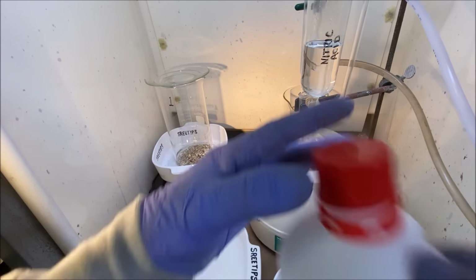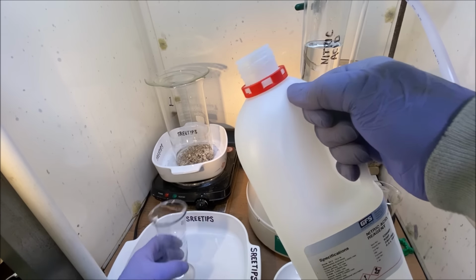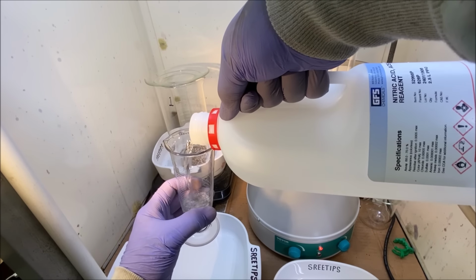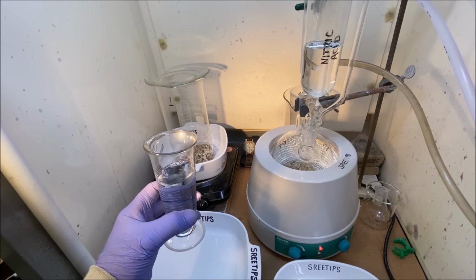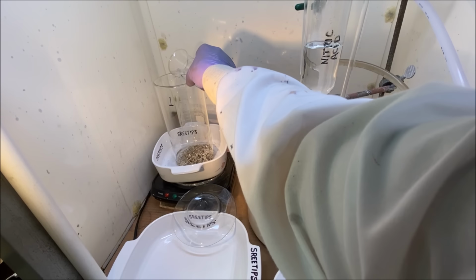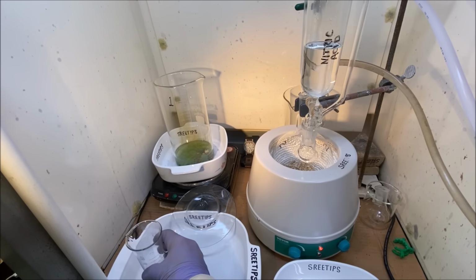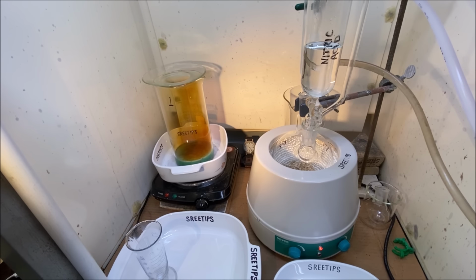And then what I'm gonna do is measure out some nitric acid, 100 milliliters. We're gonna add this to our open beaker back here in the back. Just gonna dump it right in. Here we go. I will put this on time lapse and just let both reactions happen.